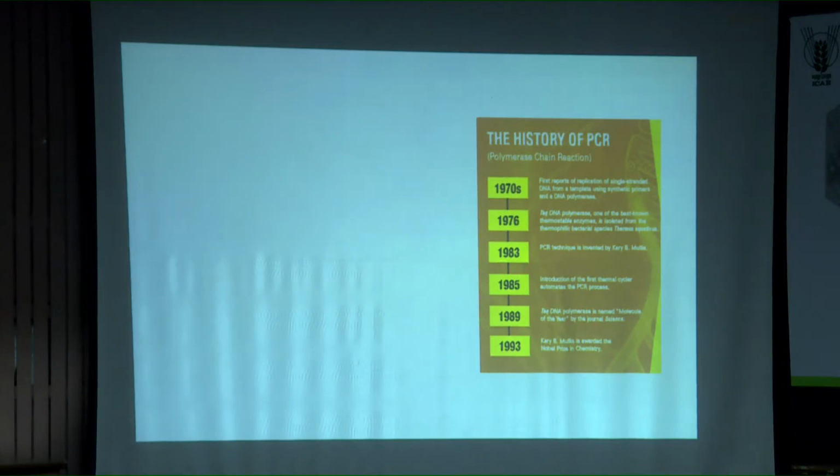I think that is just coinciding with the emergence of the subject, molecular biology, and stepwise things started coming together, and the tipping point in in vitro replication of DNA happened in 1983. In 1983, it was demonstrated that DNA can be replicated in vitro, right? Just by changing the temperature and adding specific ingredients in the PCR mix. I'm sure all of you must be knowing about these developments.